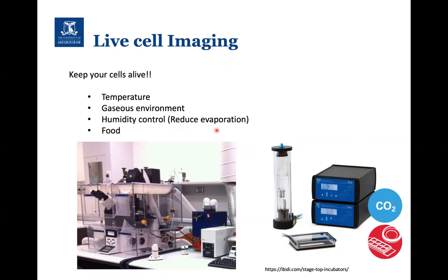Again, you don't want to get to the end of your experiment and say, well, I've still got about a third left of the media that I put on there at the start. That's not a good way to run the experiment. And then the final thing is just to make sure that the cells are going to be happy for the duration of your experiment, so you've got enough nutrients in there to keep them going for that duration.